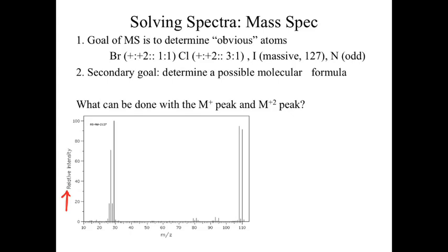The next part of this is what's going on the y-axis. Well, what we're monitoring is the frequency, or ultimately a way of looking at the stability of that individual particle. So the more stable that positively charged piece, the more likely that that compound forms.